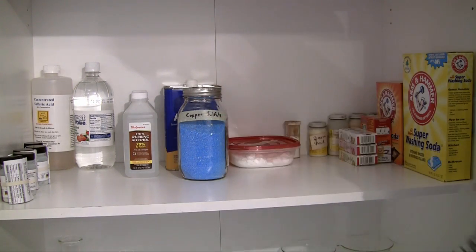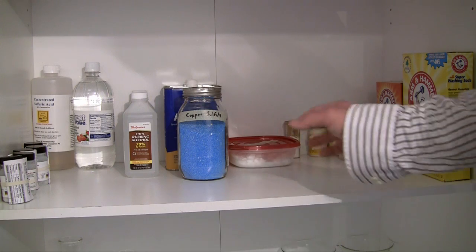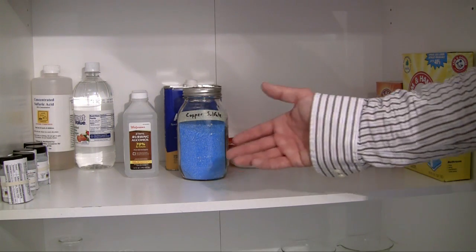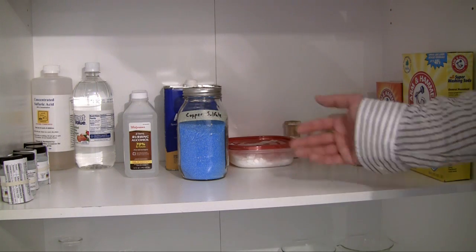And the last mini tip I have is make sure not to store reactive chemicals next to each other. If something happens like you have a leak in the bottle you don't want it reacting and causing an explosion.